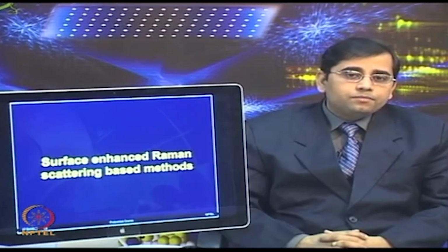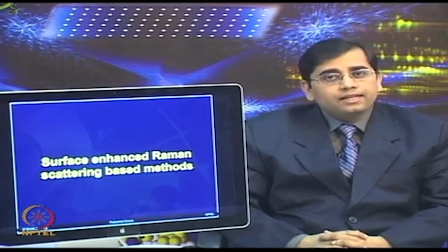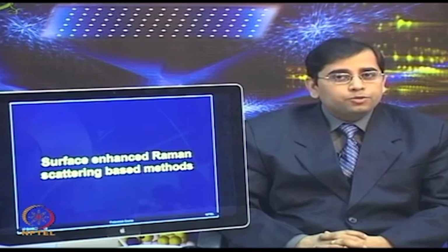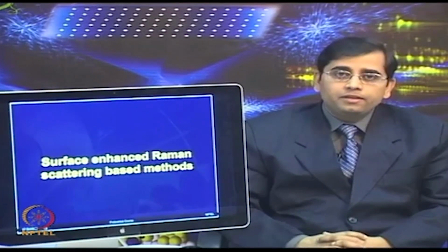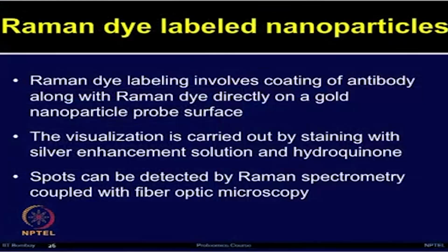The surface enhancing agents include gold and silver, as well as functionalization with target molecules, which enhance the sensitivity of Raman spectroscopy. Let us now look at how the system has been employed for detection methods for microarrays. Let us talk about Raman dye labeled nanoparticles.